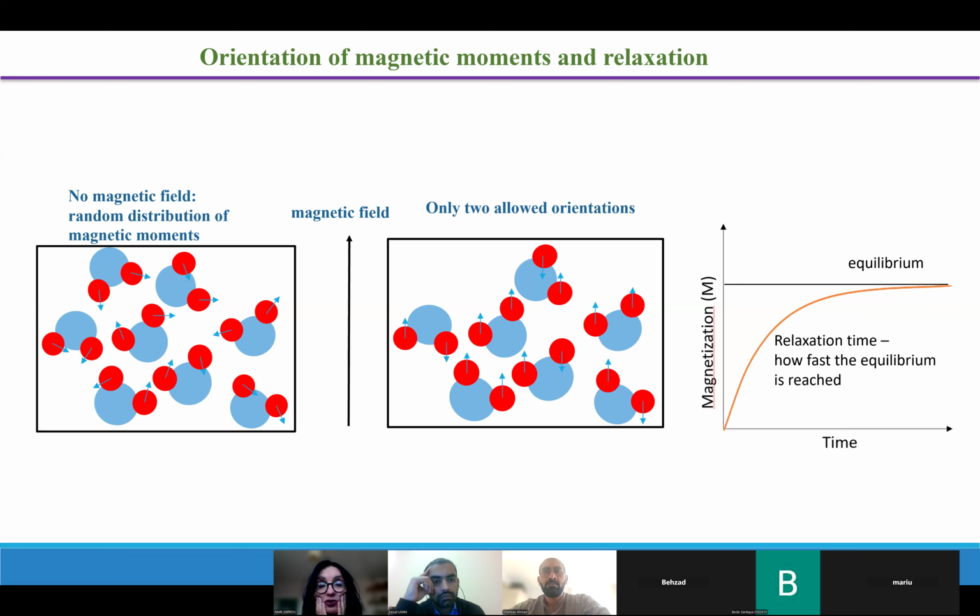Because you must have a sufficiently large magnetic moment for the electronics to be able to measure what is happening. For this purpose, you must have a sufficient number of protons, so the difference between the number up and the number down is sufficiently large, and the net magnetization resulting from this difference is sufficiently large. But you will never be able to say this one is up or that one is down.